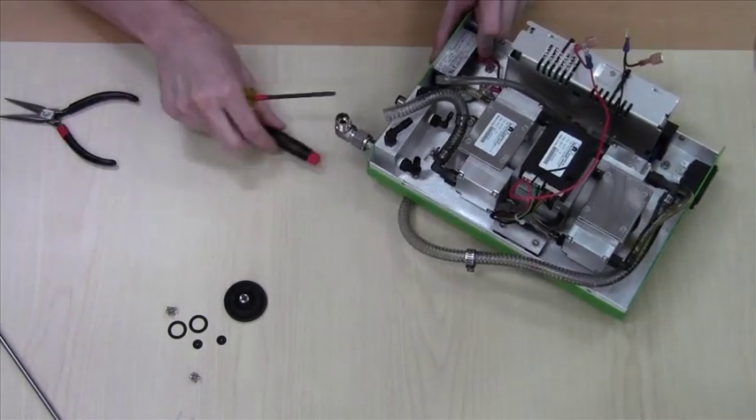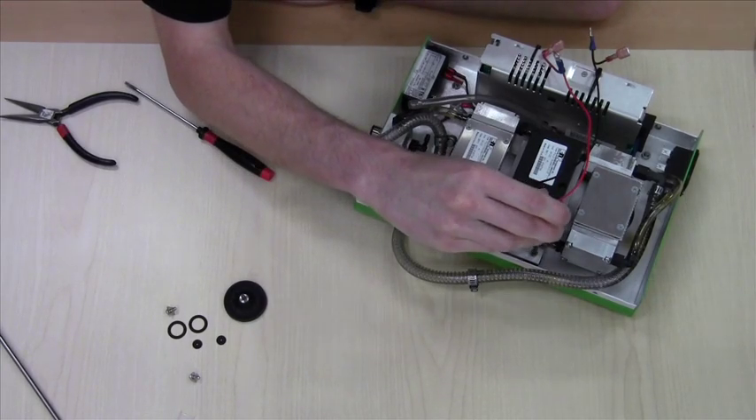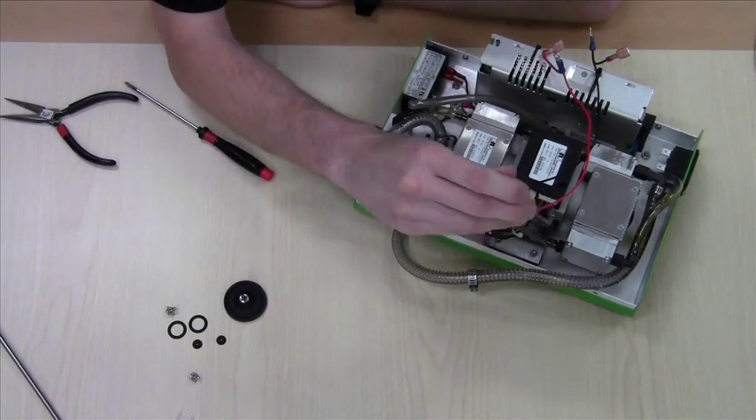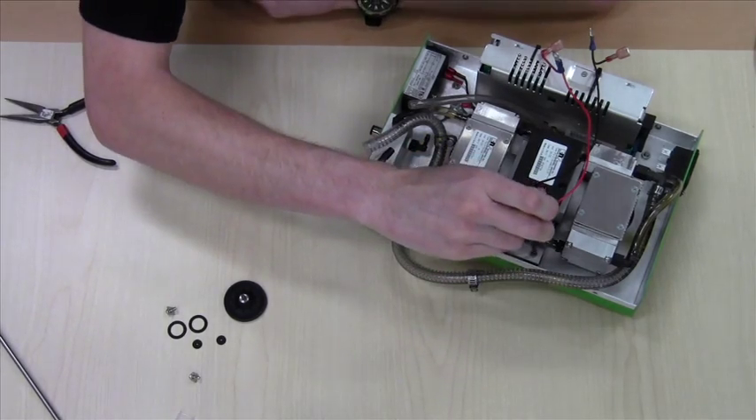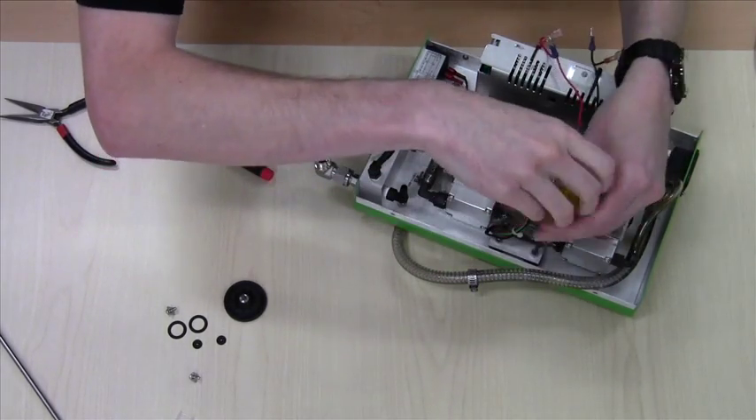Next, depending on the model of the pump, you'll either have Phillips head screws for the mounting base or you'll have Allen. If it's Allen you will need a 9/64 driver. Go ahead and remove all four of those.